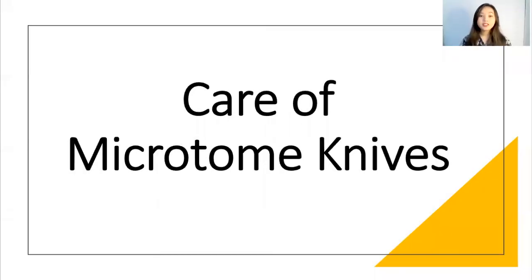It is important to learn how to use and take care of the microtome knives, especially for someone who is working in a pathology laboratory. A sharp knife in good condition is indispensable to the histologic technologist, and it is the most important requirement for satisfactory sectioning. Now, there are methods in sharpening your knife, and we'll be tackling those.